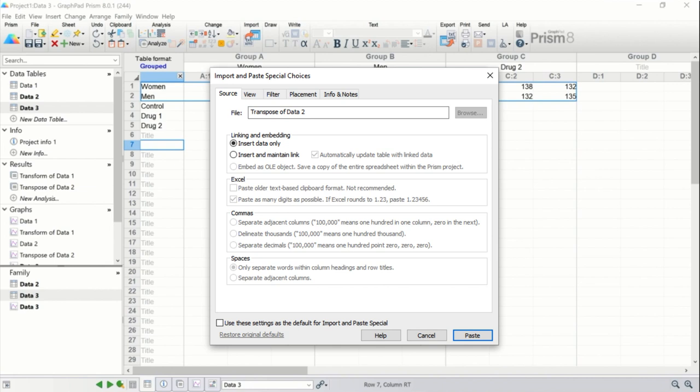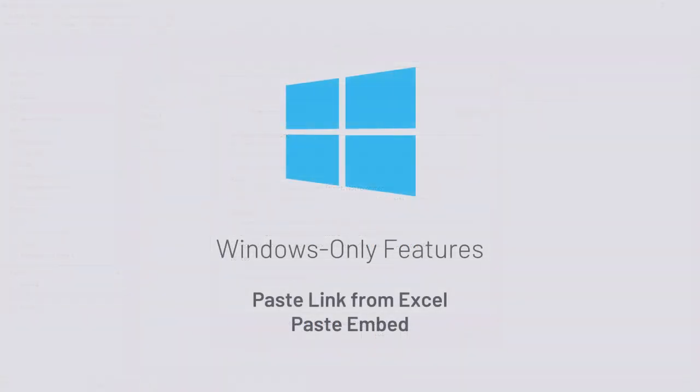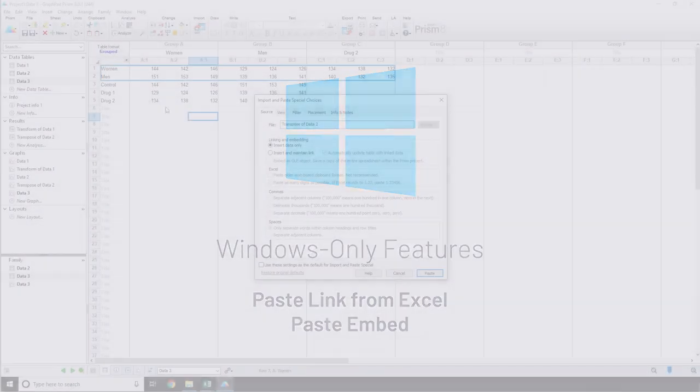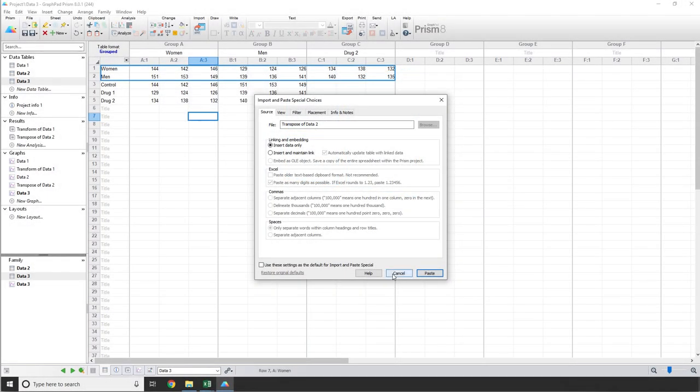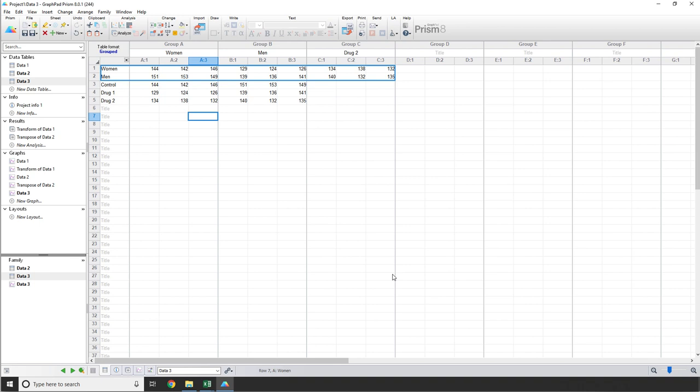You can choose to simply insert the data with no links or insert the data and maintain a link similar to what we saw earlier when pasting links from copied Prism data. Note that if you're linking from an external source, you can choose to have Prism automatically update the linked data when the source is updated. Finally, in the case of copying data from Excel, you can choose to have the selected data entered into the data table and have it linked to a copy of the entire Excel workbook embedded within the Prism project. Let's look at an example of copying data from Excel and how to use paste link and paste embed. I do need to point out here that this is an example of a feature built using the OLE technology I mentioned earlier. And so paste link from Excel and paste embed are going to be a Windows only feature until a Mac OLE equivalent is developed.